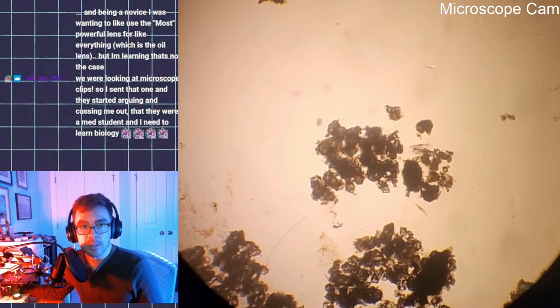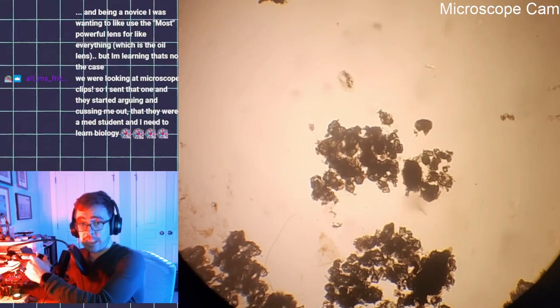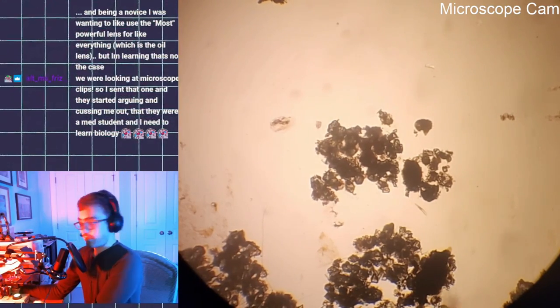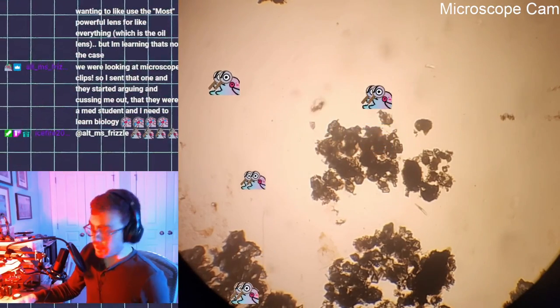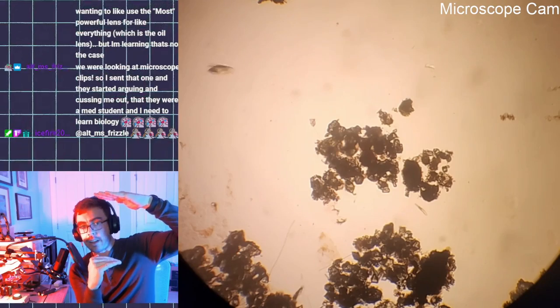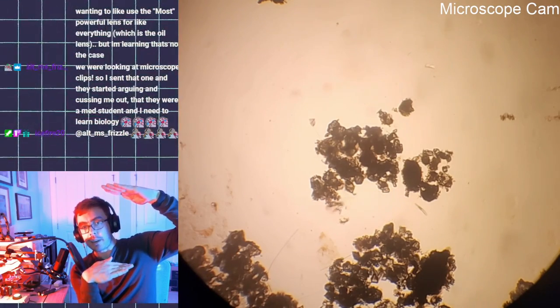Yeah, so it's really dependent on what you want to look at. I would love my most powerful lens to be more useful. It's dirty, I can't quite fix it. But having the most high-powered lens isn't necessarily the best thing. If you think about it, when you move between objectives, the objective that we're looking at now, the range of clear, in-focus things is like this big, but as you go down and down, it's more and more compressed.